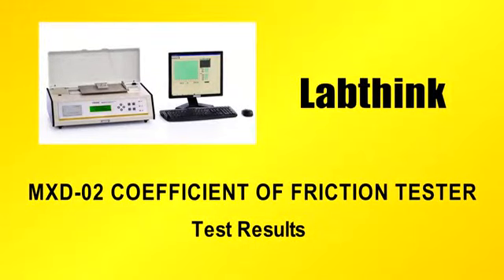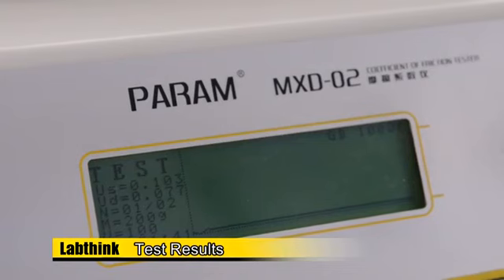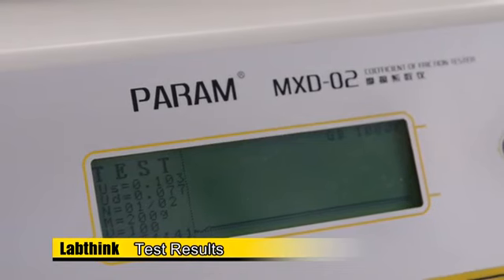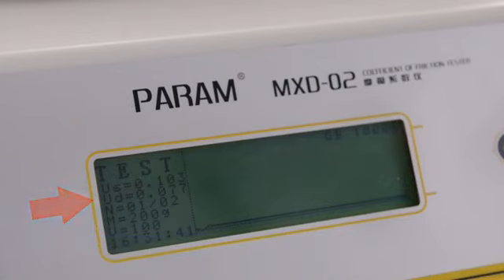Test results. When the test is finished, the test curve and test results will be displayed in the test interface. The test results can be viewed on the screen. US is the static coefficient of friction. UD is the dynamic coefficient of friction.